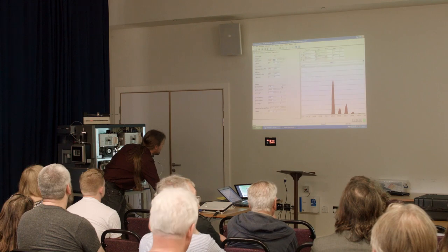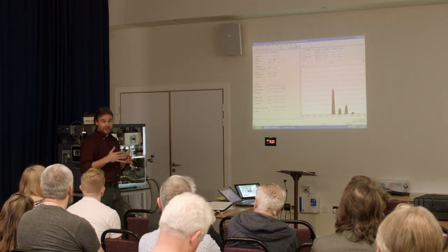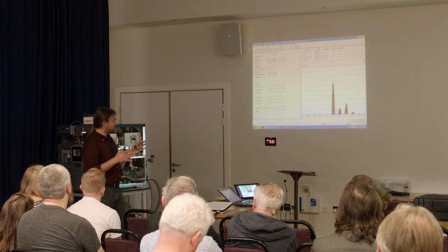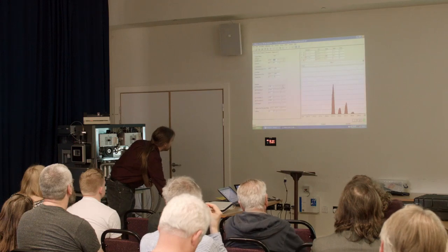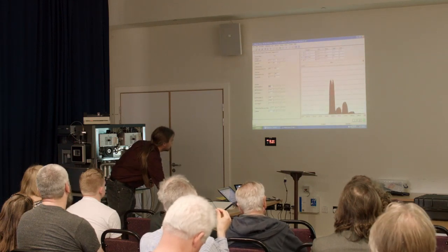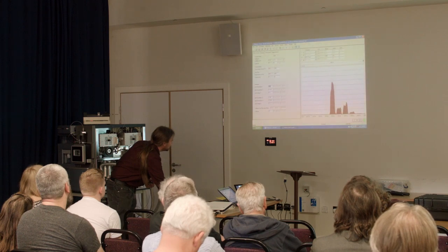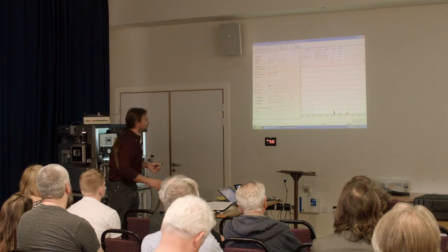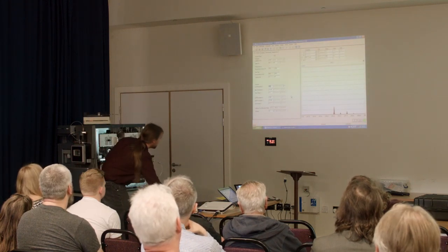We've also got the mass resolution here. Now, the quadrupole is using radio frequency and direct current, and the ratio of the radio frequency to the direct current is about 10 to 1. We can change the ratio, and if we do that, we can make the peaks fatter or thinner. So this is our mass resolution, our mass resolving power. But you don't get something for nothing. If we increase the resolution, we get less sensitivity.